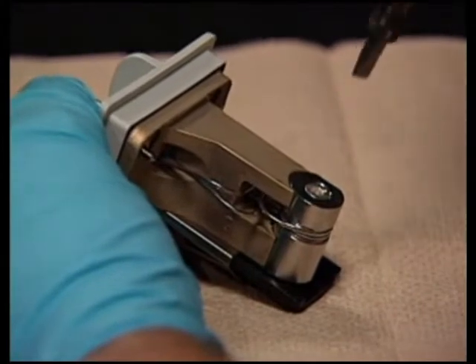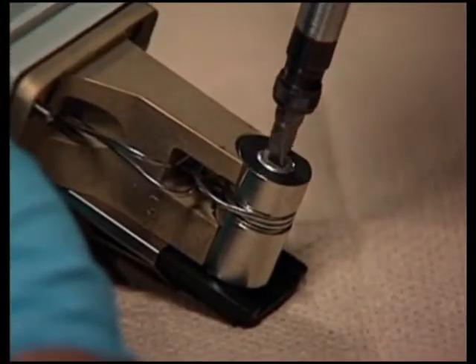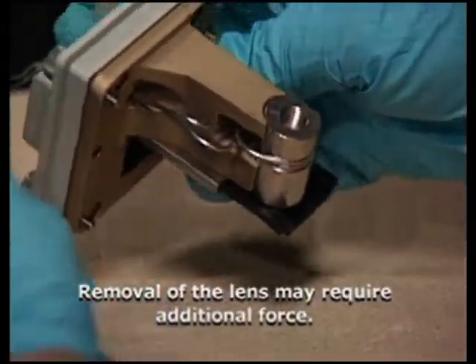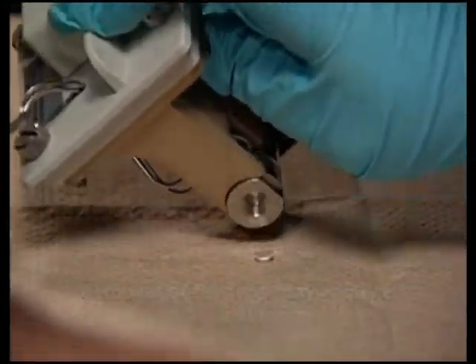Using a flat blade screwdriver, remove the entrance lens screw. Rotate the flow cell so that the entrance lens is facing downward and give the flow cell body a light tap to remove the lens.